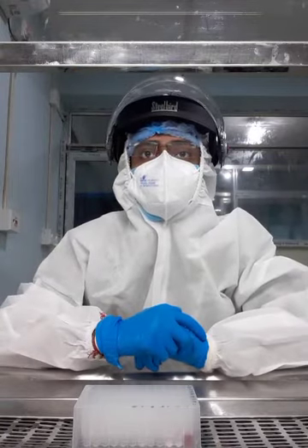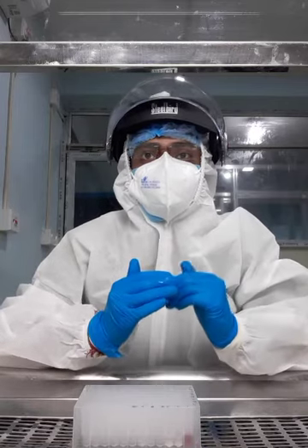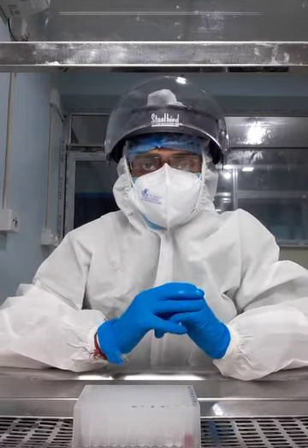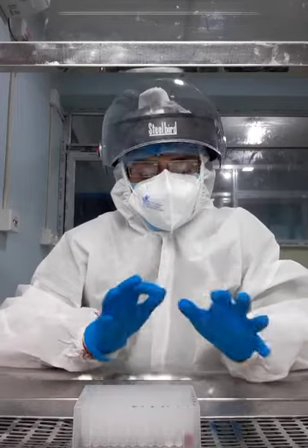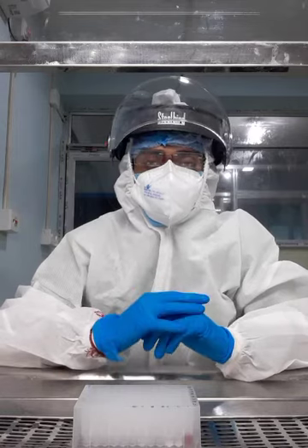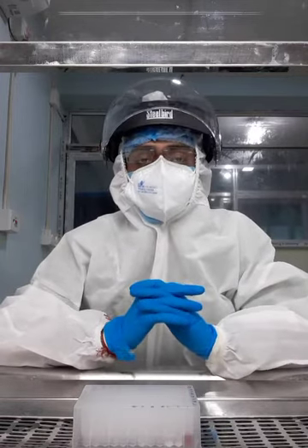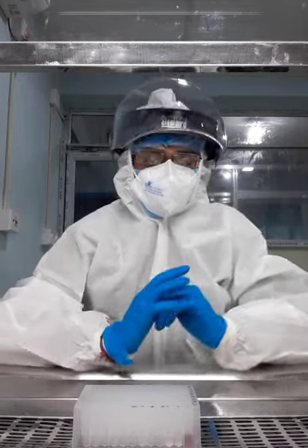After putting the VTM sample in the first column, you have to mix the VTM sample and the T-lysis buffer properly, about 5 times. After completing putting the VTM sample in the first column, you have to sanitize your hand every time. Then you have to put the sample B for another person, then samples C, D, E. Every time you have to sanitize your hand with the help of sanitizer.